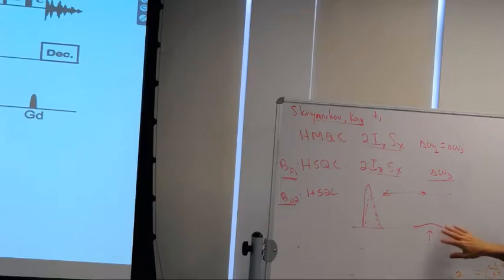And since we don't really care about measuring the rate directly, we can just use a fixed value of the irradiation time. We don't have to vary the irradiation time. We'll just fix capital T, record one spectrum, move the RF carrier, record another one. As it turns out, it's useful to do the whole process twice with different values of omega 1 of the B1 field, say 25 hertz and 50 hertz. Having that data is helpful.